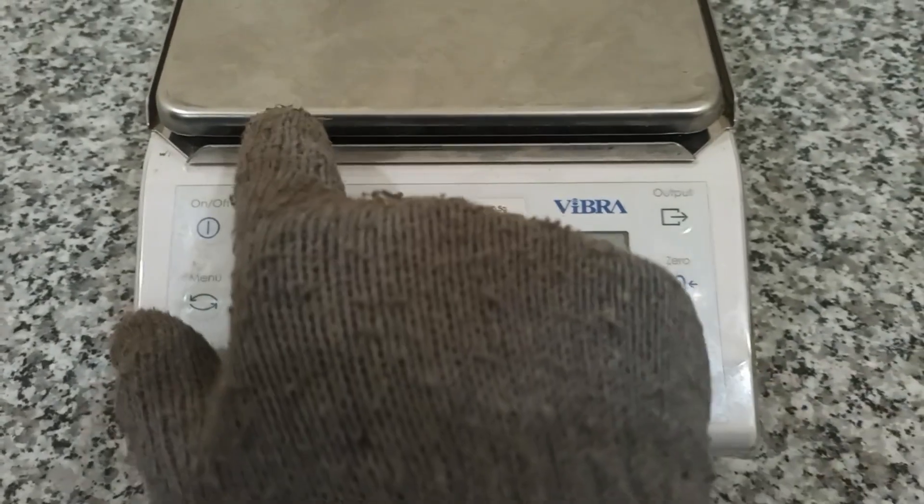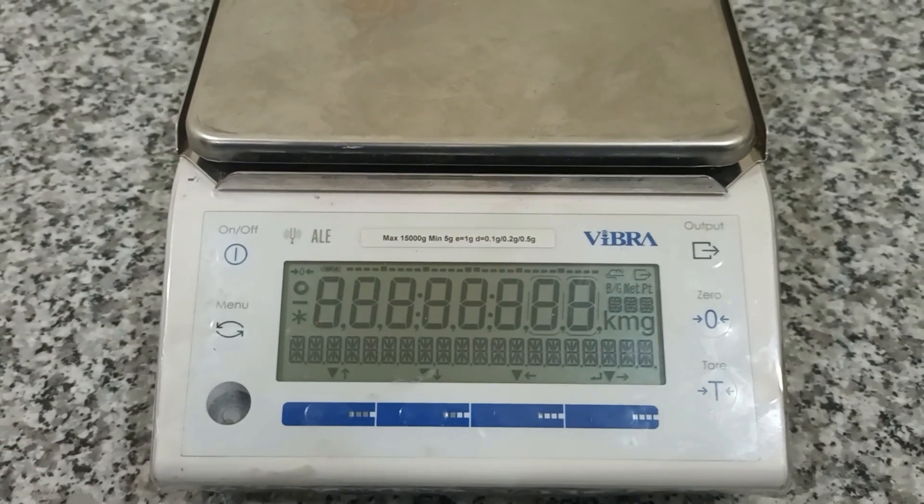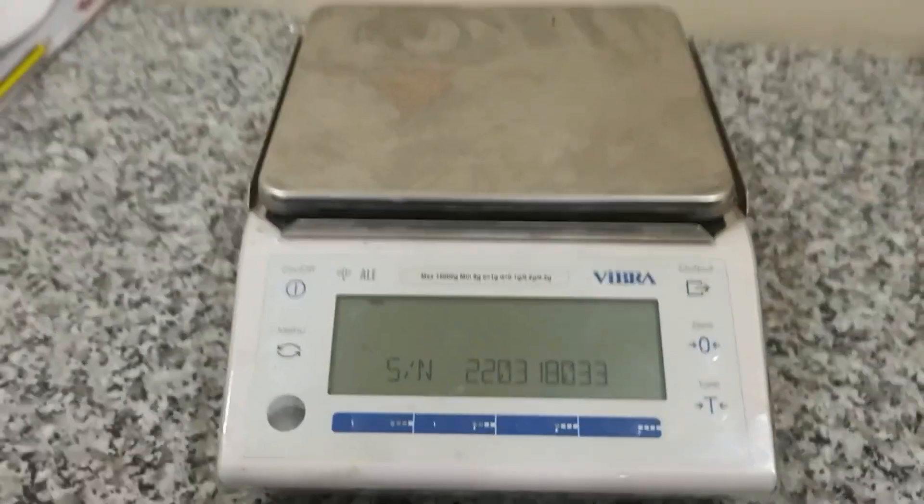Hello. This is the balance. First, I turn on the balance, yes — this balance.